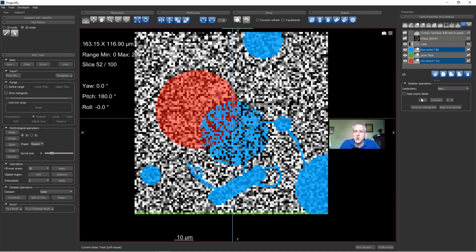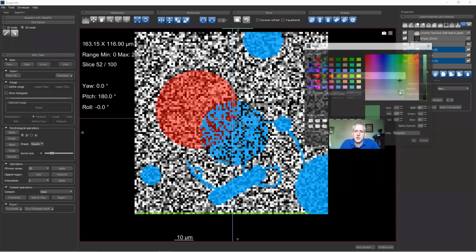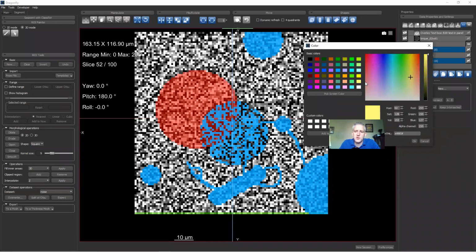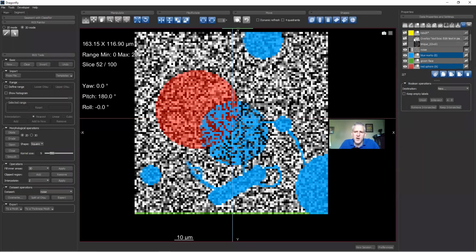If I take the union of these, I'm going to tell it I want to put it in a new ROI. And I'm going to say union by clicking union. And it's going to say, okay, we're going to put that in a new ROI. Instead of calling it union, I'm going to call it result. And then I'm going to change the color to yellow, so I have good contrast with my other ROIs. Yeah, that yellow is fine. So I click OK.